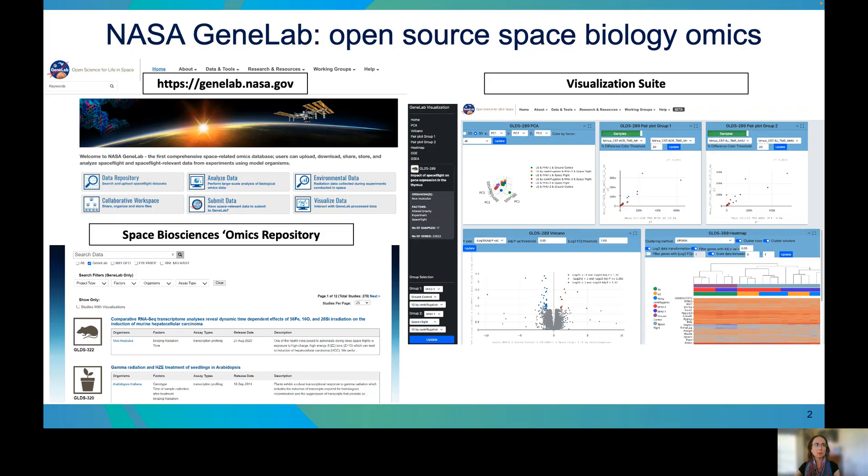NASA GeneLab is an open-source, publicly available repository for spaceflight and space-relevant experimental omics data, mainly for model organisms. The repository is searchable by several factors, including organism and assay type, to find relevant datasets. GeneLab also hosts a visualization suite with several data image tools, including PCA, Volcano Plot, and Heatmap.